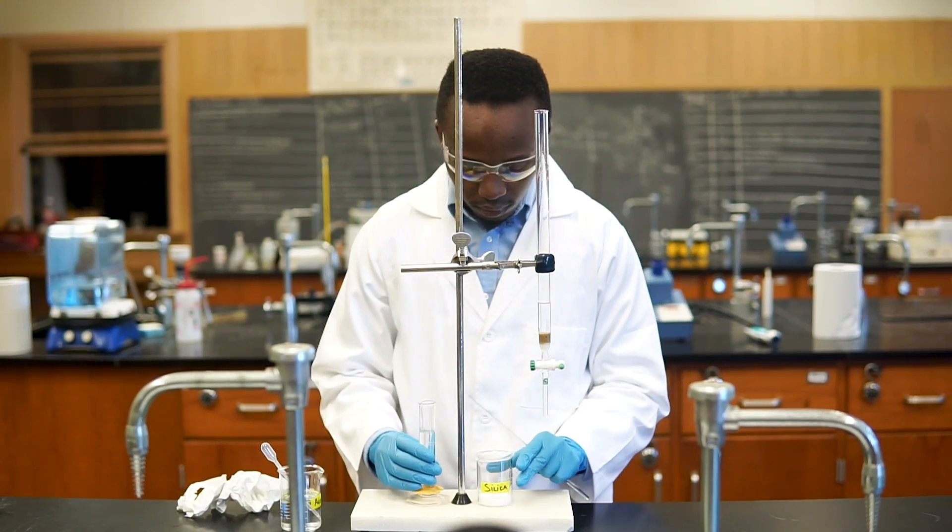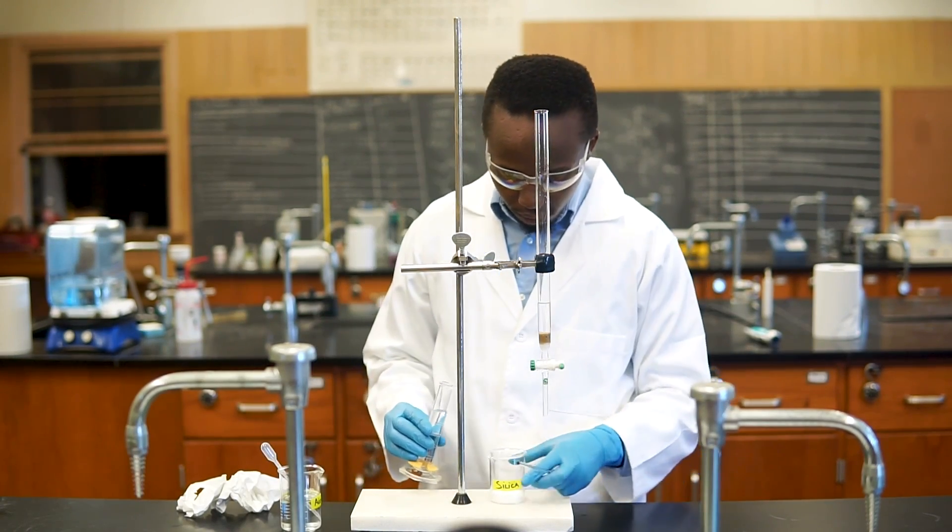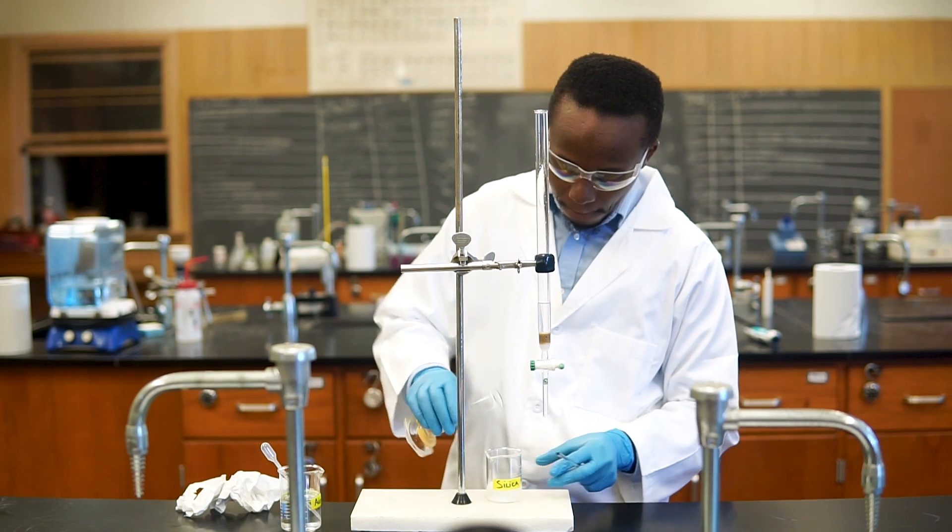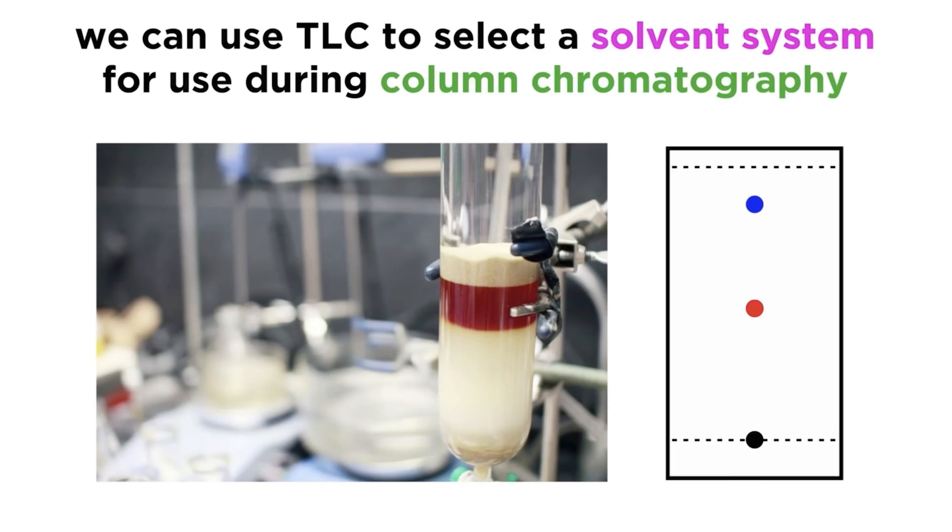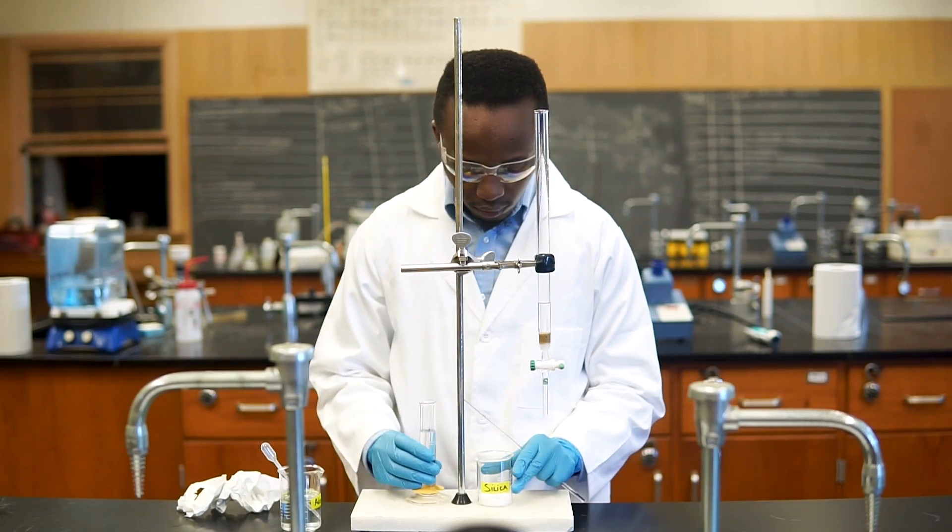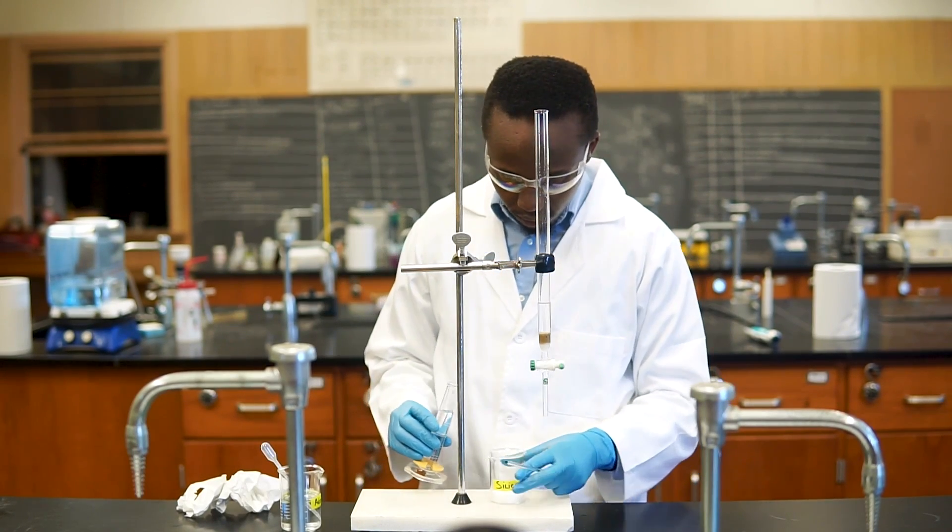Now we're going to prepare the gel by adding 25 milliliters of our solvent to the silica powder. The solvent we're using is also known as the eluent for column chromatography. An appropriate solvent for column chromatography can be chosen by performing TLC on your mixture in various solvents and combinations, such as hexanes and ethyl acetate. You can then choose one that gives the best separation. Since the TLC plate also utilizes silica, just like in our column, the separation pattern will therefore be the same. In today's experiment we're using a one-to-one acetone-ethanol mixture as our solvent.